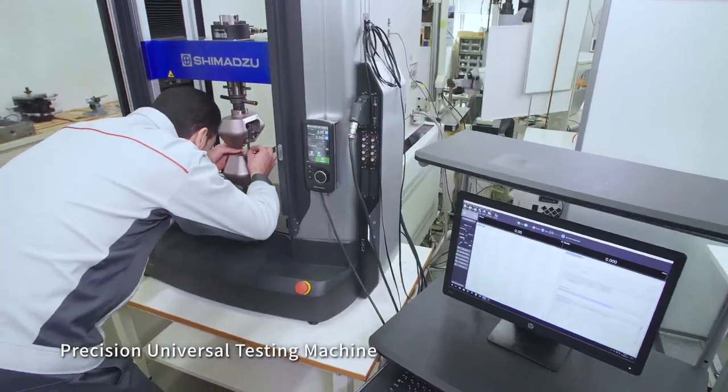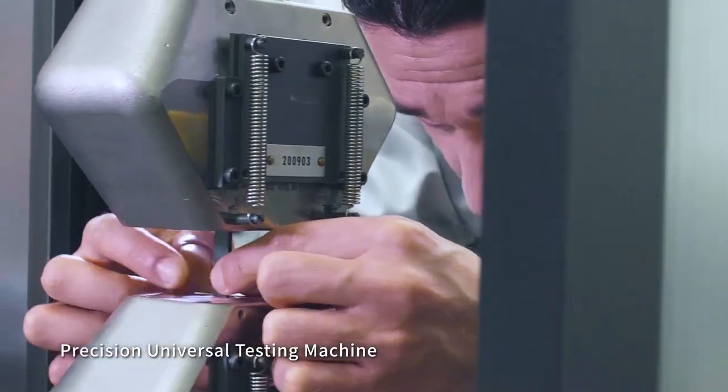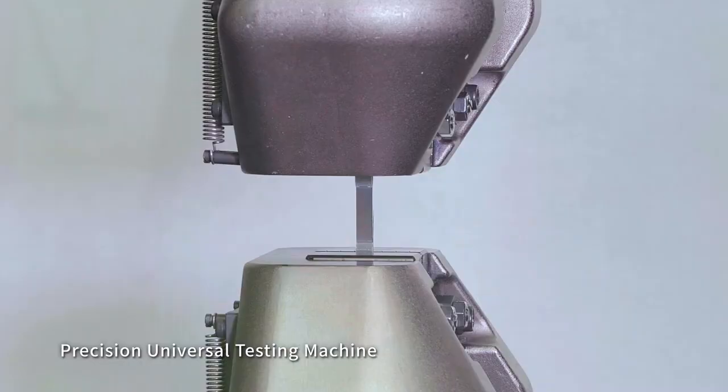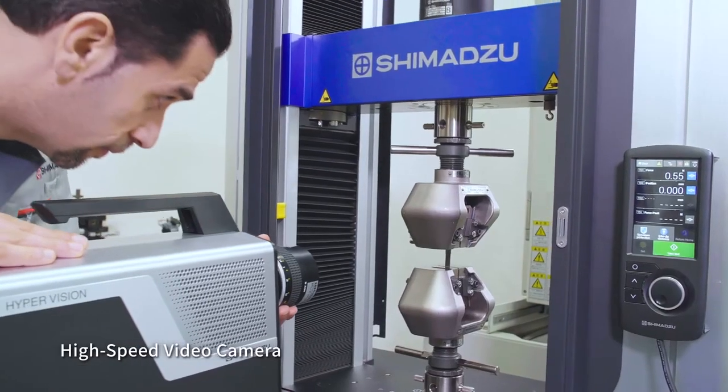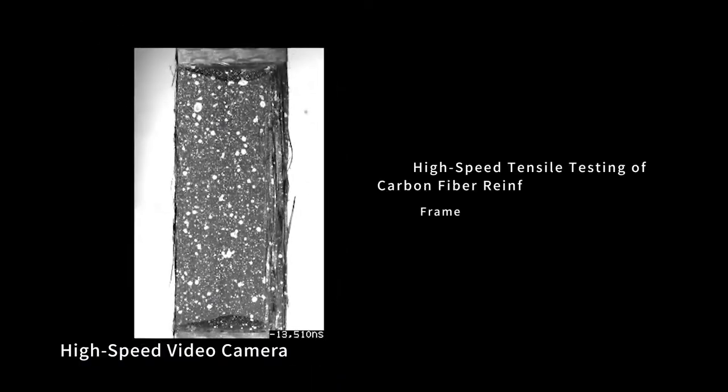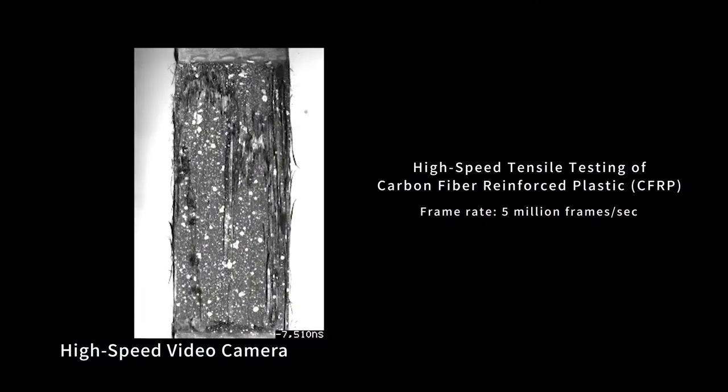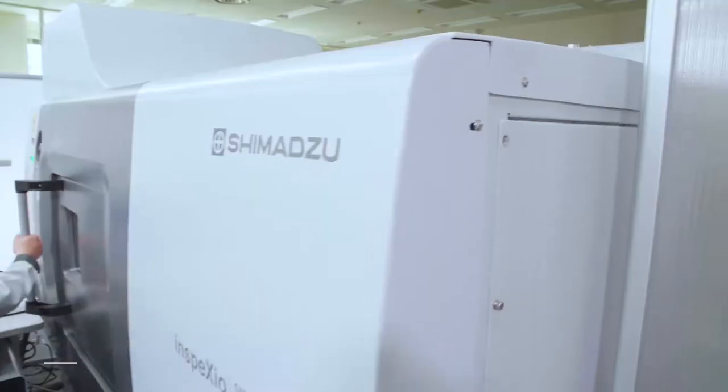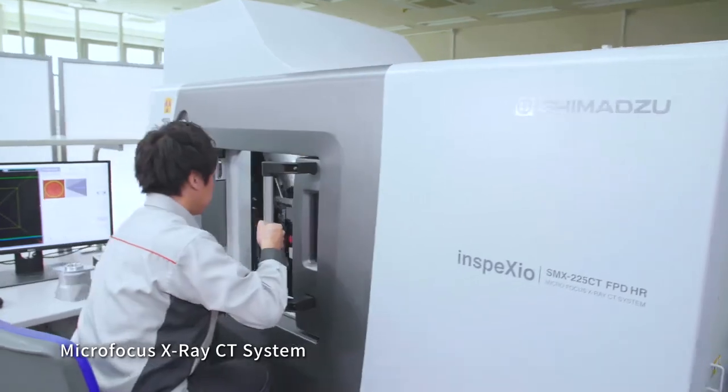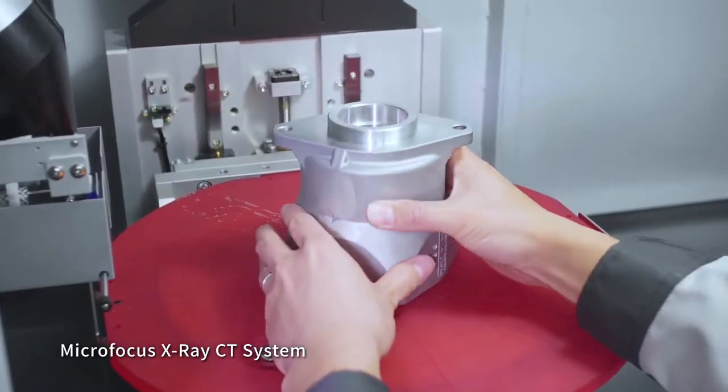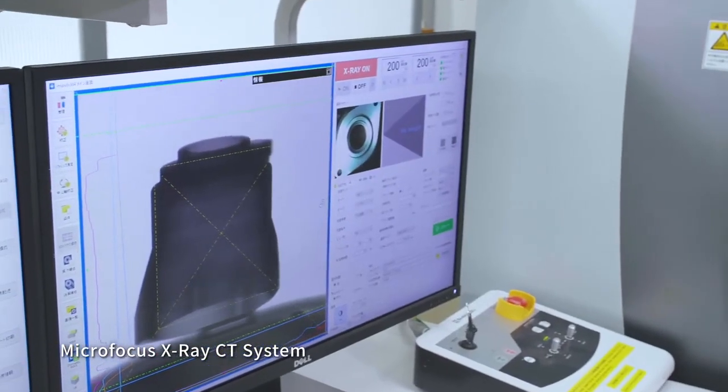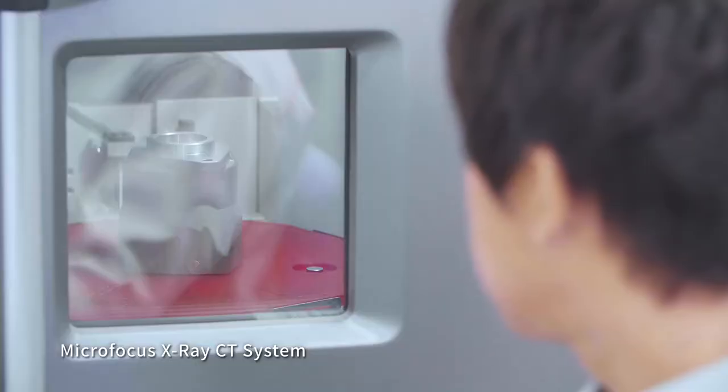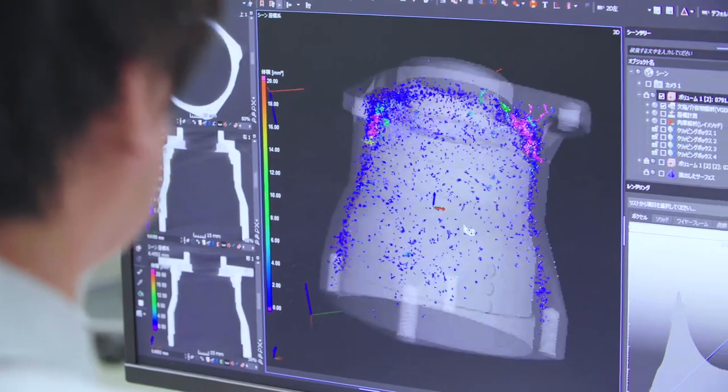This is a precision universal testing machine that measures the strength of various materials, such as metals and plastics. With high precision measurement technologies, including high-speed video cameras that can visualize phenomena such as material failures that cannot be captured by the human eye, as well as non-destructive inspection using x-rays, we support all kinds of manufacturing by measuring safety and durability.